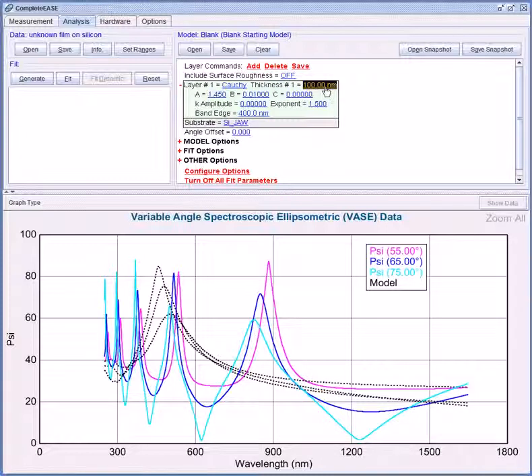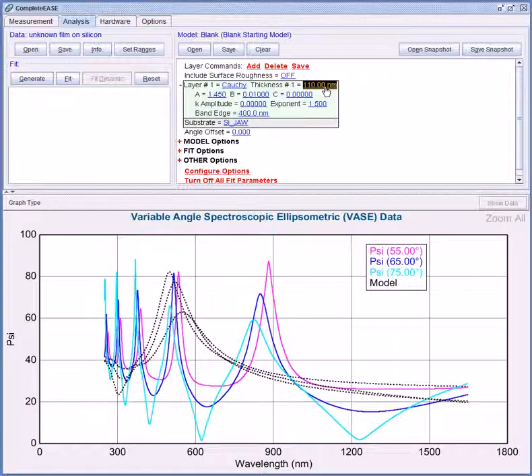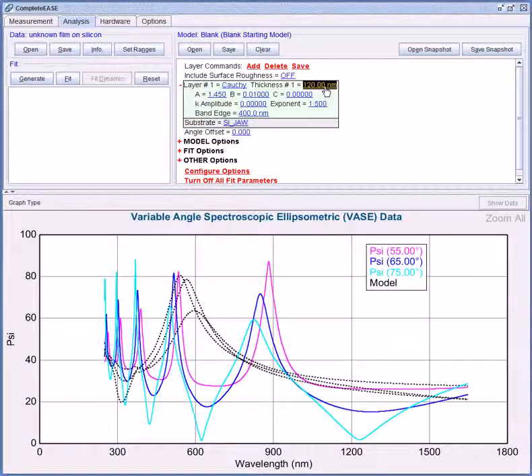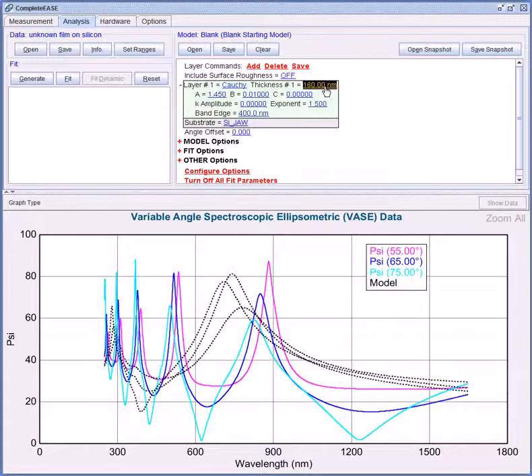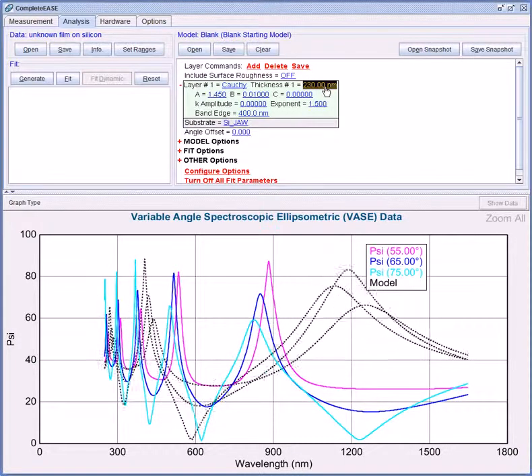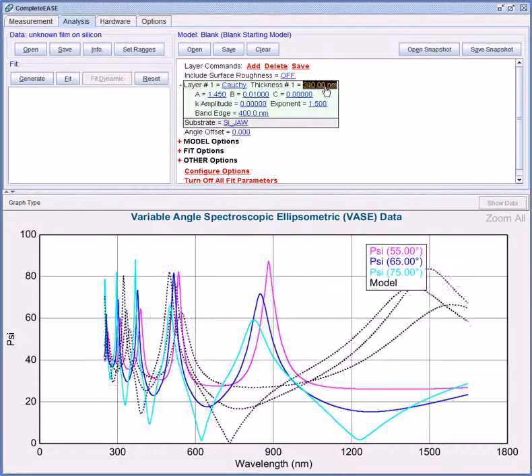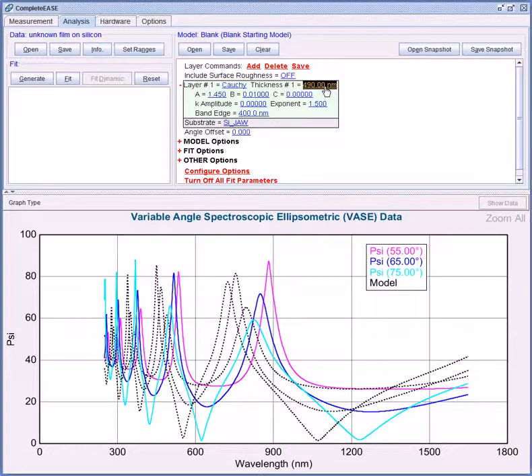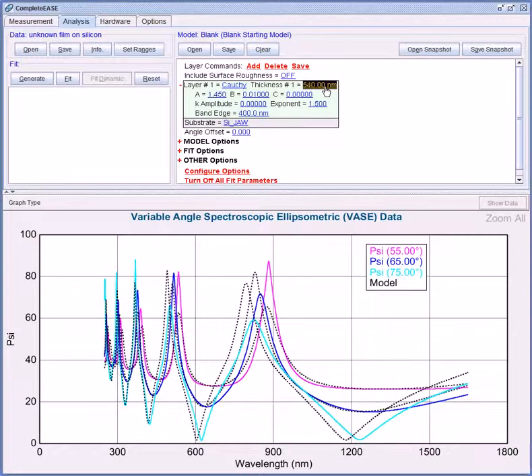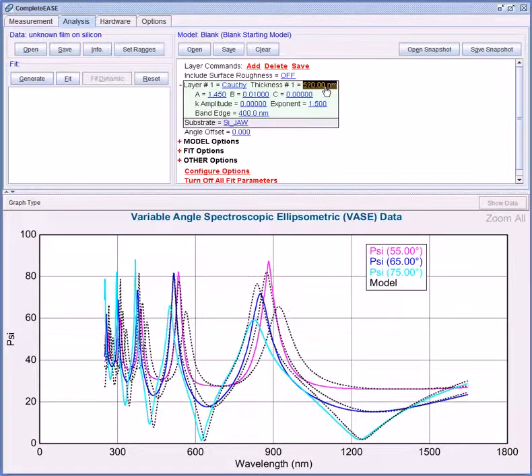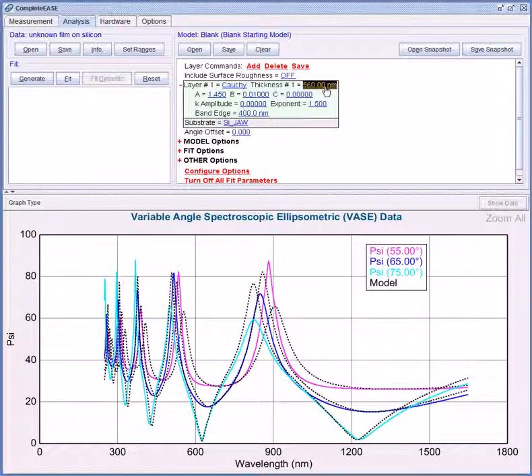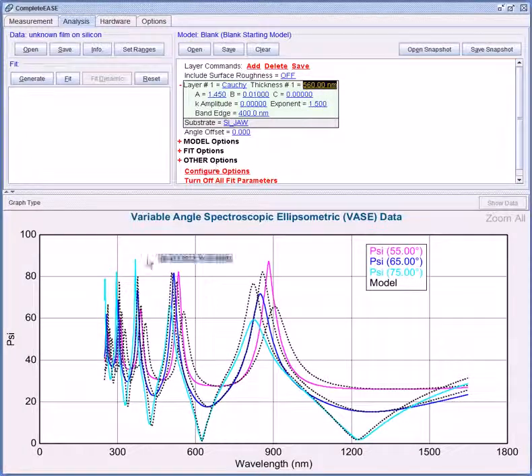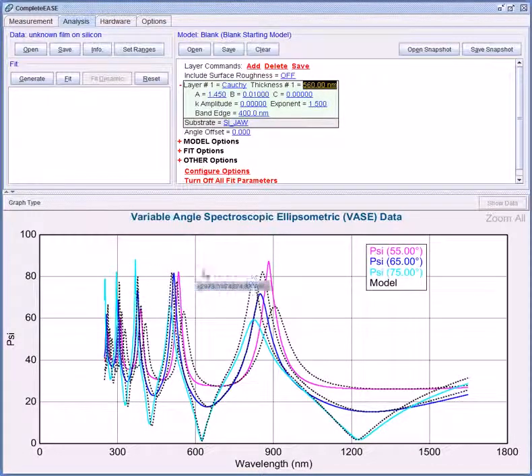I can hold my mouse over this value, press the shift key, and scroll the mouse wheel up to increase thickness. And as I do this you can see the number of oscillations in the model generated curves are increasing. When I get around 560 nm the number of oscillations is a much better match.